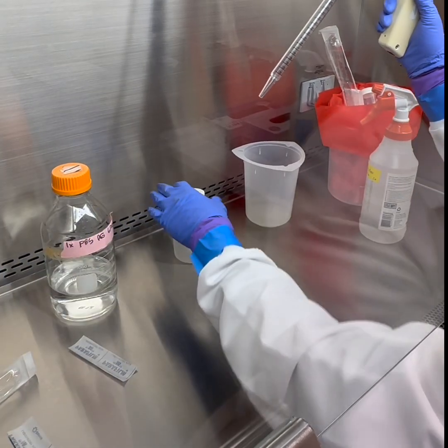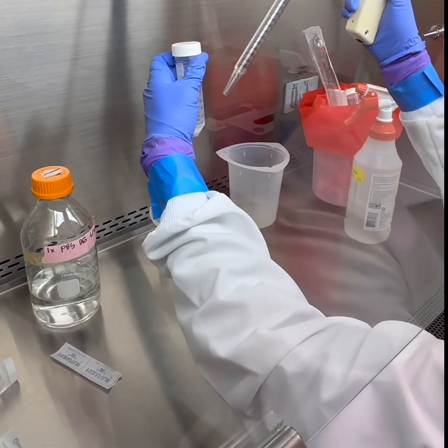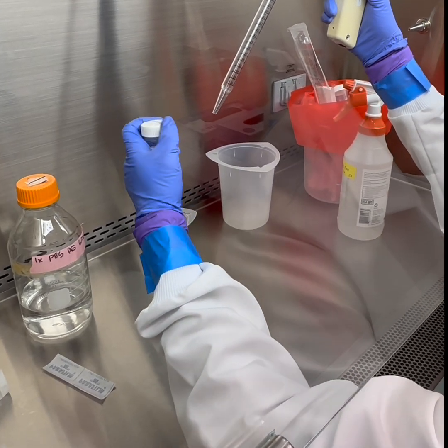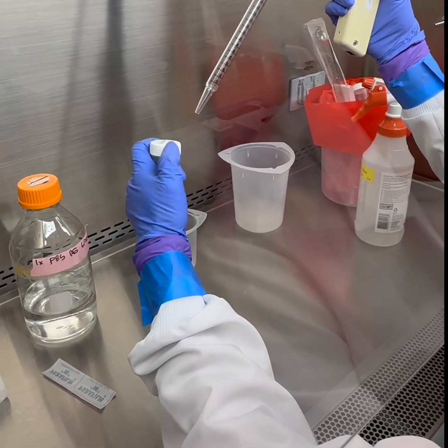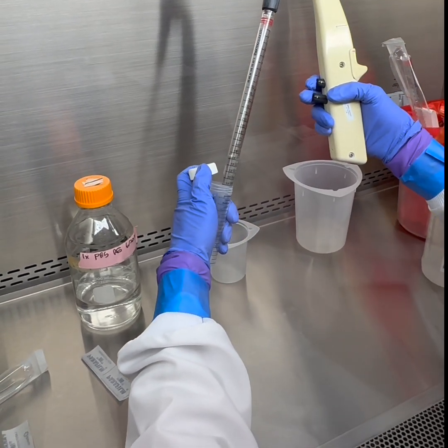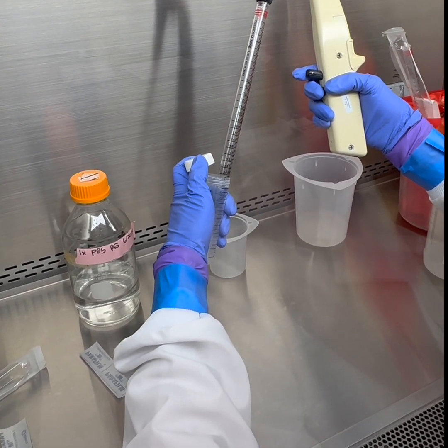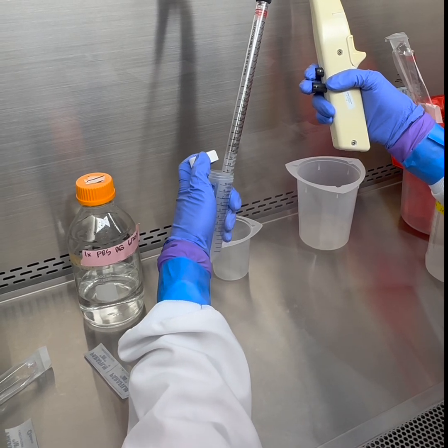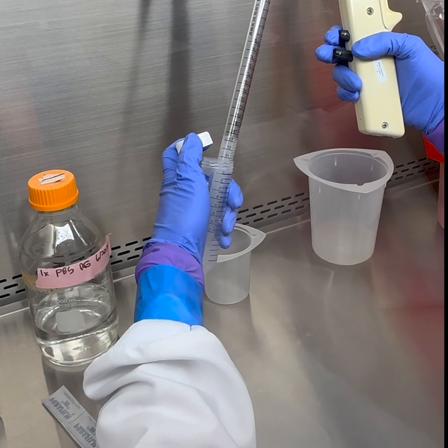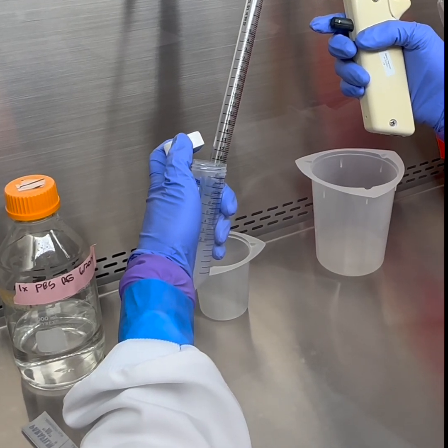I'm using a 25 milliliter pipette so that I don't mistakenly pull up too much, because there's only 25, and contaminate the pipette. All right, now all that I'm going to do is resuspend vigorously via aspiration and dispensing. You'll see it's kind of breaking up. There are little specks. You'll want to do this until it's completely homogeneous.